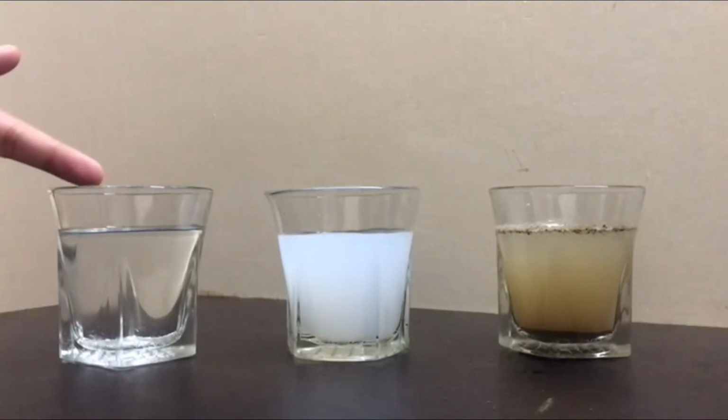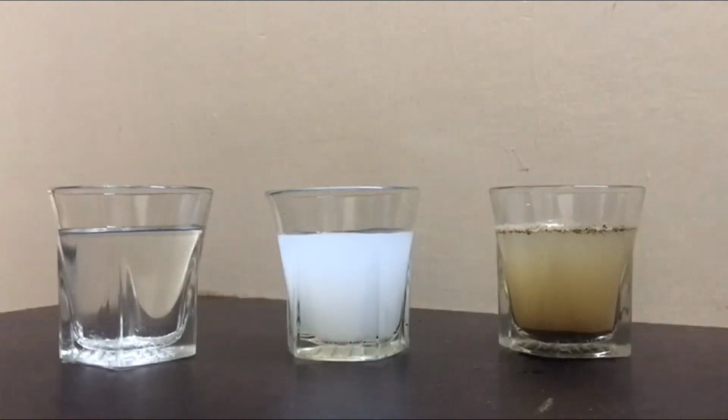The first beaker contains salt water. I dissolve some table salt in water. The salt has completely dissolved, forming a true solution. The particles are so tiny they are practically invisible.